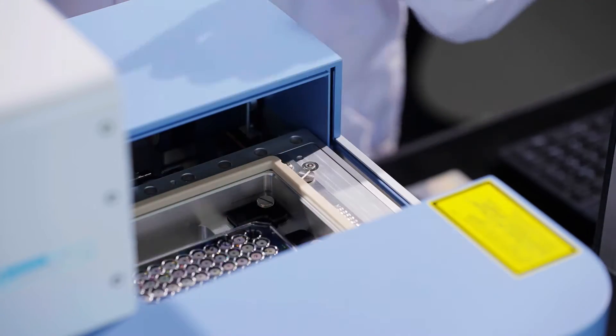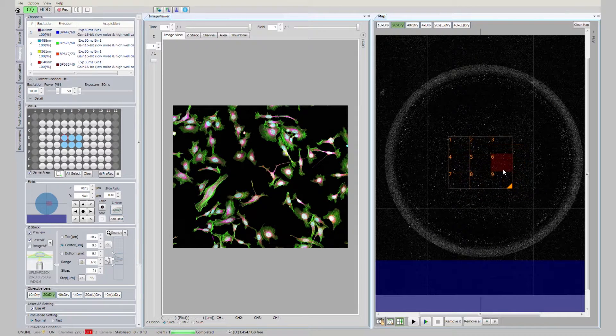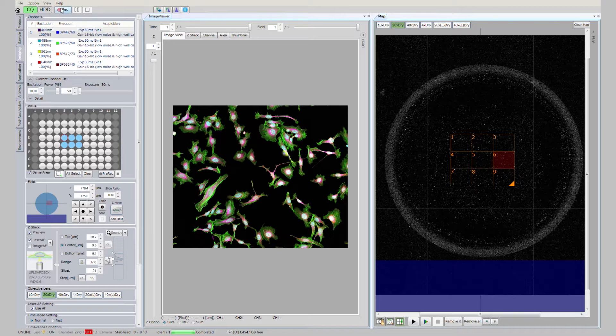Once the sample is selected, the acquisition of multi-color confocal images is simple thanks to intuitive operational software.